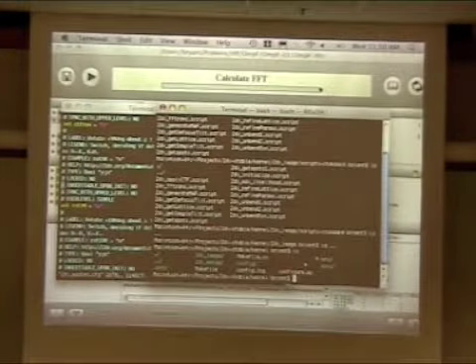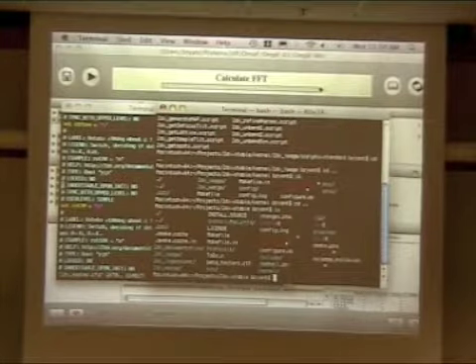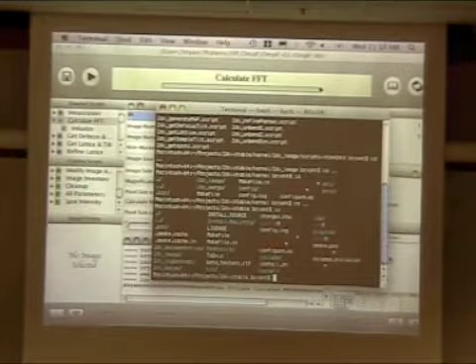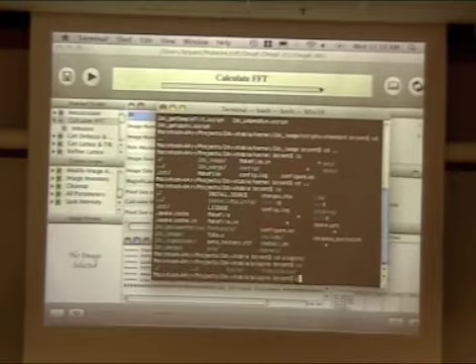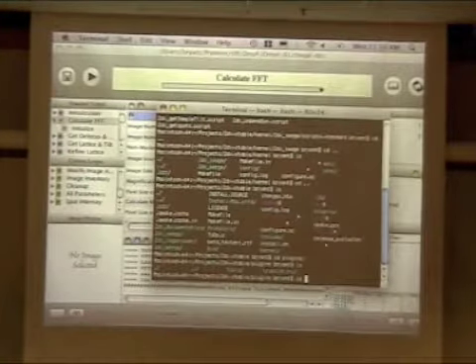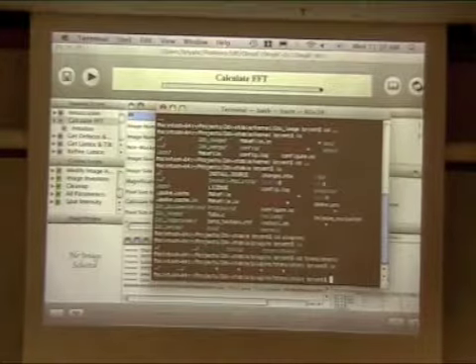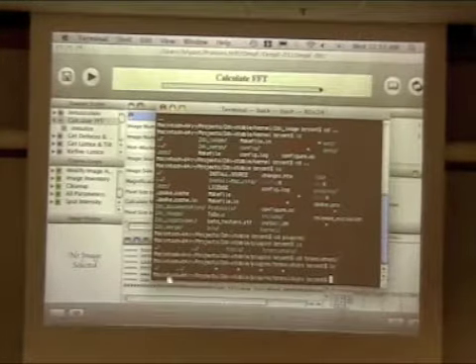One of the major undocumented features that we've got in here is in the main directory. You can see, let me just close this, it's a little less cluttered. There are a bunch of directories, some important, some not so, to what you want to do, but we do have this plugins directory. And if you look in there, there's a soon-to-be-useful tools directory, not too much in there yet. And then there's a translators directory, and this one is useful at the moment, at least in 2DX merge. It occurs to me that this might not be in 2DX image yet, but it's easy enough to put in there.